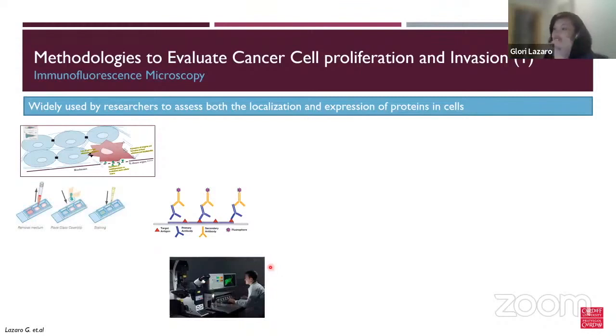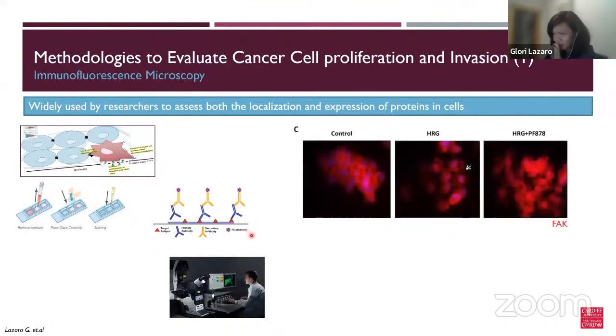So it's really a technique that's widely used now, moving away from light microscopy. People are using confocal, this immunofluorescence microscopy, to visualize cells. And so what kind of data do we get out of this? So this is something that I've done like years ago. I don't remember how long anymore.